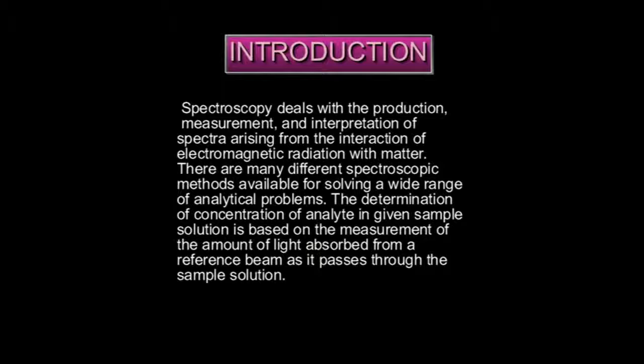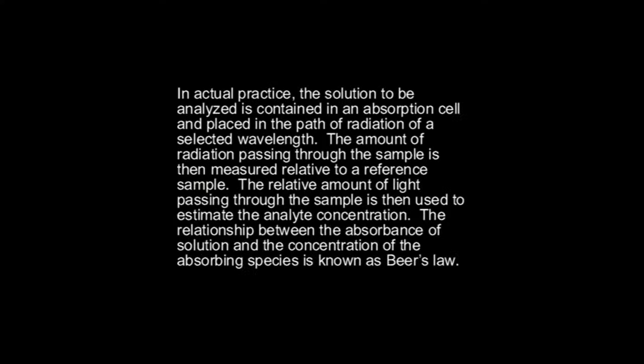There are many different spectroscopic methods available for solving a wide range of analytical problems. The determination of concentration of analyte in the given sample solution is based on the measurement of the amount of light absorbed from a reference beam as it passes through the sample solution.